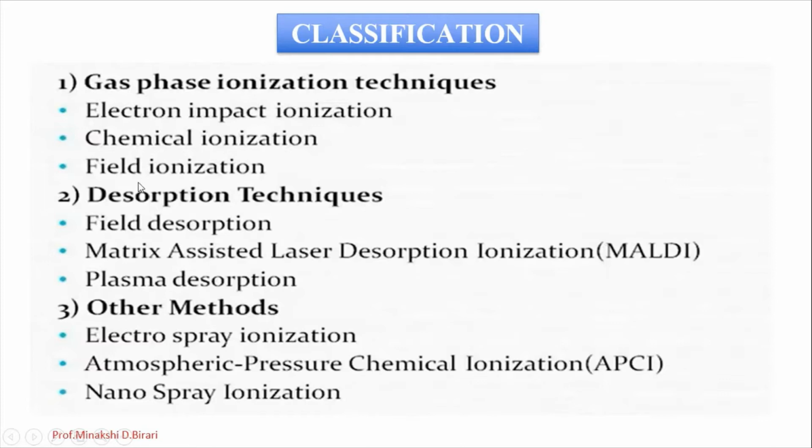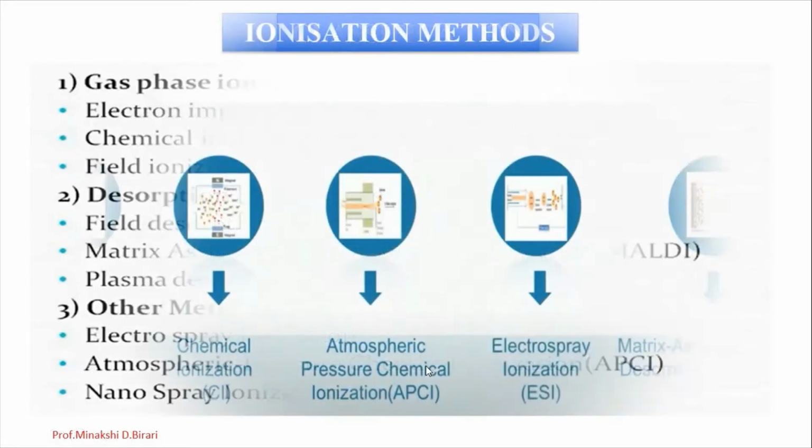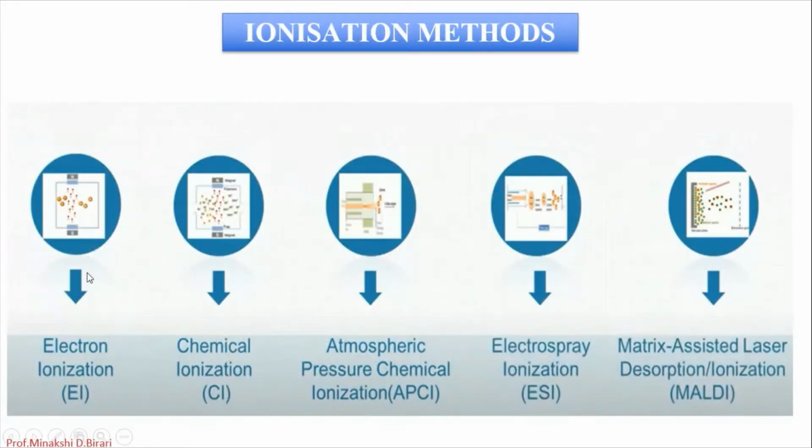A few techniques we have studied in previous lectures: electron ionization, chemical ionization, electrospray ionization, thermospray ionization, matrix assisted laser desorption, FAB, fast atom bombardment, like that. In today's lecture, I am going to explain atmospheric pressure chemical ionization, APCI, and atmospheric photoionization, APPI.